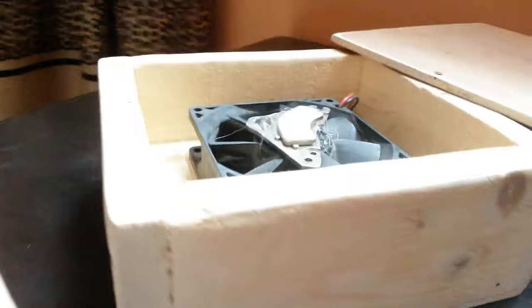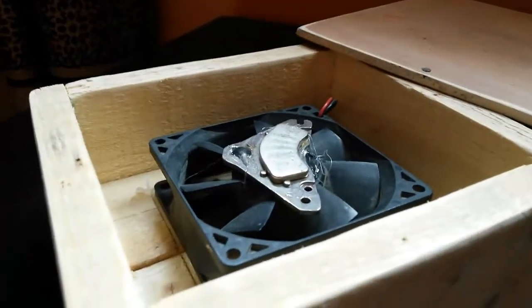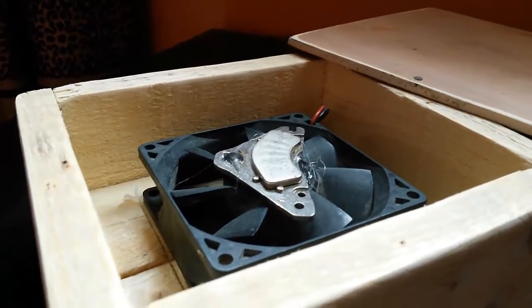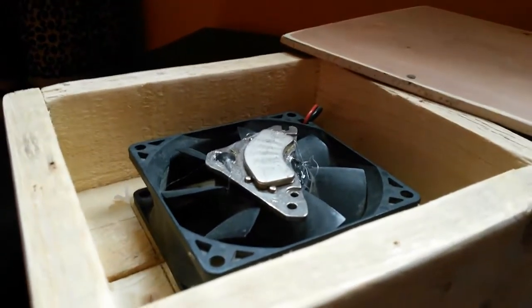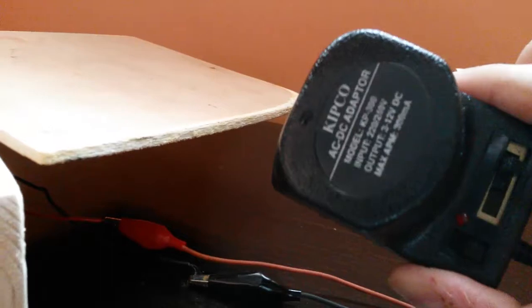Basically, a lab stirrer is a device used in most laboratories to stir objects for long periods of time, and the speed is of course controlled with a variable resistor. For this I'll be using a variable output adapter.